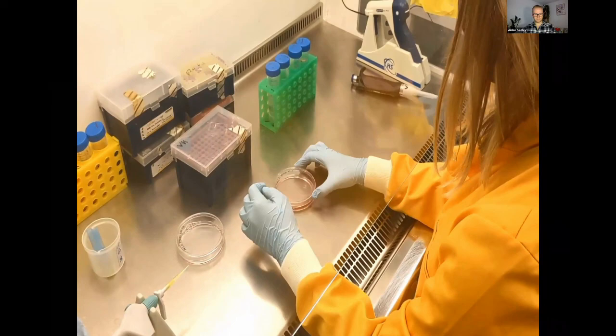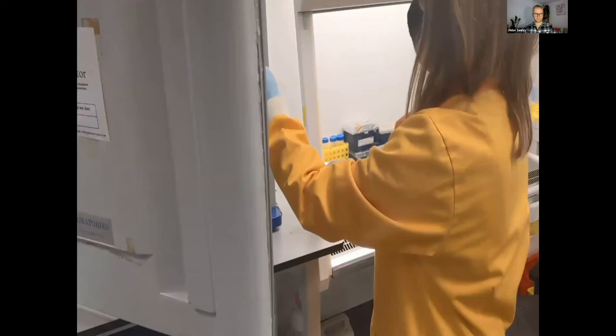The cells are now ready to be returned to the incubator to continue growing and dividing. Looking under a microscope, we can see that the cells are at a much lower density, giving them plenty of room to multiply.